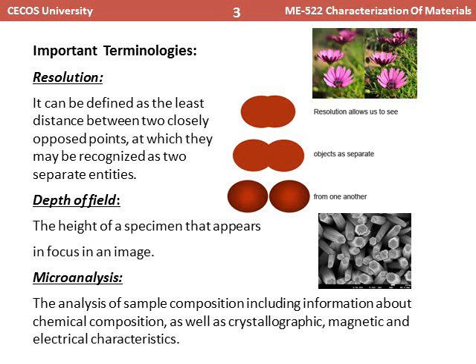So you can see things like the height of something. The height of something in SEM is normally referred to as depth of field, but the height will not be a true height.